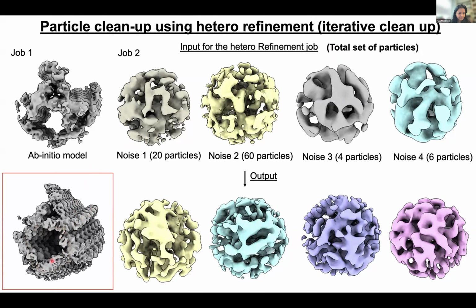Further, we wanted to understand the reason for multimerization of Cat1 dimers. In order to understand that, we solved 2 more structures, one with a non-hydrolyzable NAD analog, BAD, and another one with NAD itself. What we found is that both BAD and ADPR, which is a product of NAD hydrolysis, in both cases, these molecules are present in between 2 TIR domains.